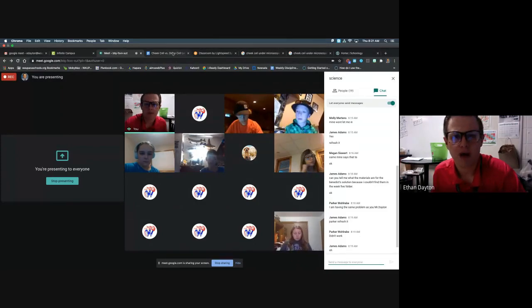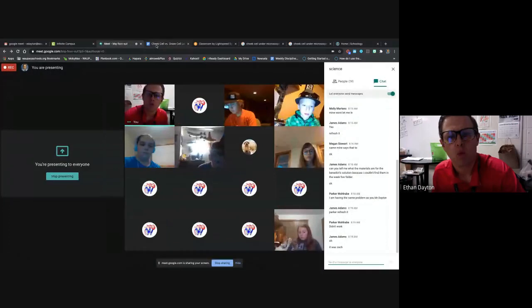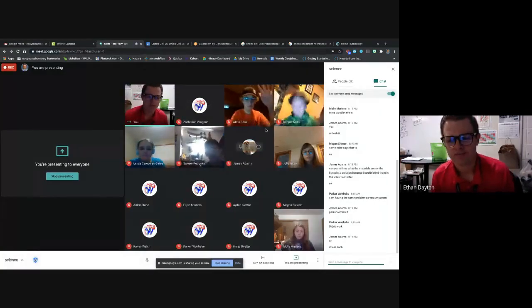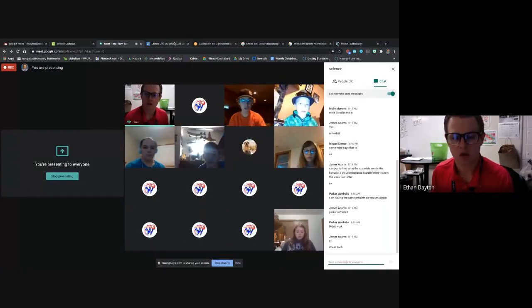You need to come up with a problem that can be answered this way. So if I look at both an onion and cheek cell, I will be able to see that the animal cell is larger, but both have the three. That was the hypothesis that we gave you. What question does that answer? Or what question does that attempt to answer? Anybody? Alton, let's hear from you again. Which cell is larger? Sure, that's a good one.